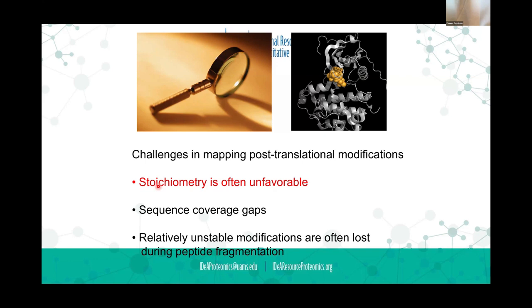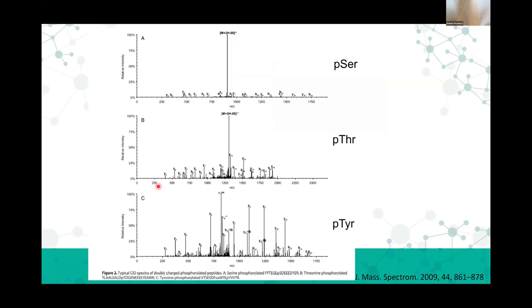Phosphorylation is labile, and we're trying to make these ions fly in the gas phase. We talked about the electrospray process and what an advance that was for mass spectrometry 40 years ago, but the issue of forming those ions sometimes is enough energy to make the phosphorylation come off. And so it comes off sooner than the rest of the peptide fragments. And so sometimes that's difficult.